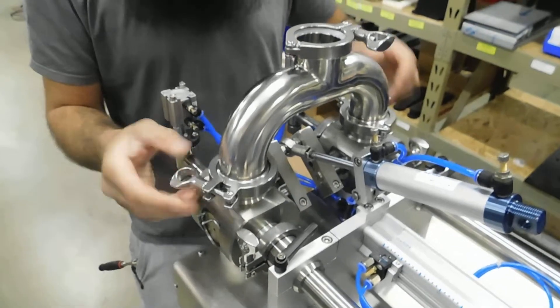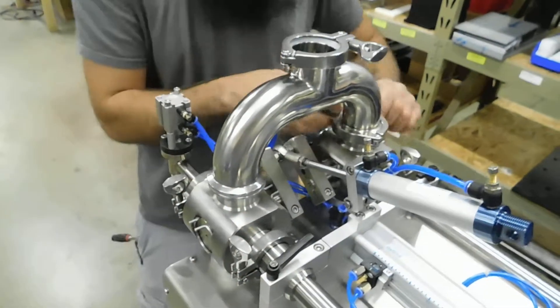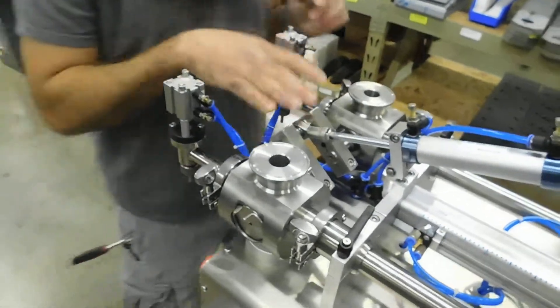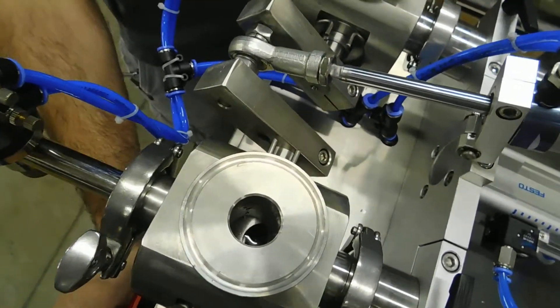So we'll take our Y-pipe off the top of our filler. This is a dual head 60 ml machine. When you look down, the air is going to be off and the E-stop is going to be depressed.